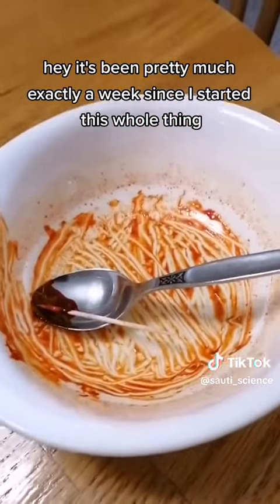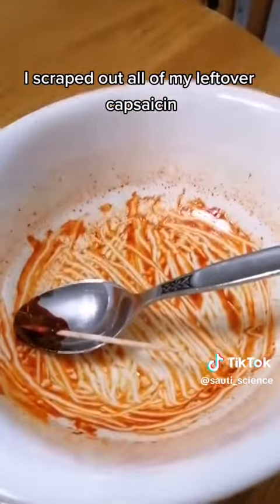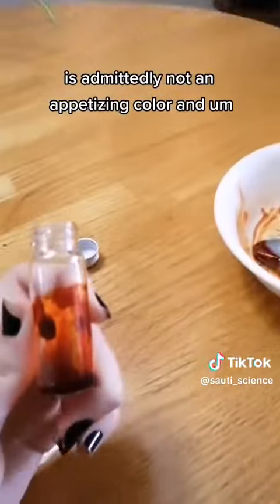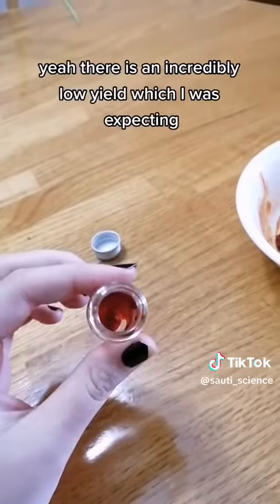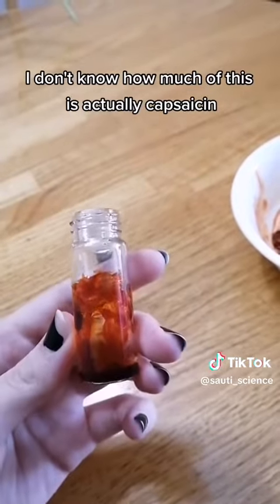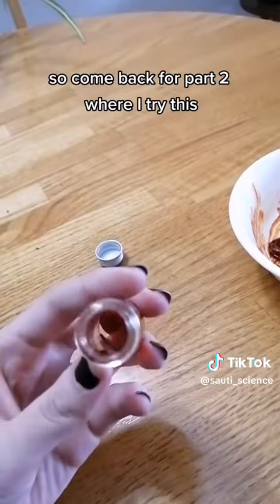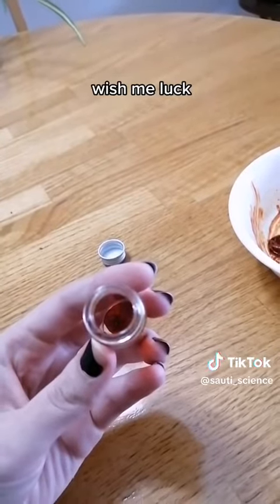It's been pretty much exactly a week since I started this whole thing. I scraped out all of my leftover capsaicin and put it in this little jar — it is admittedly not an appetizing color. There is an incredibly low yield, which I was expecting. I don't know how much of this is actually capsaicin, but I'm running out of time, so come back for part two where I try this. Wish me luck!